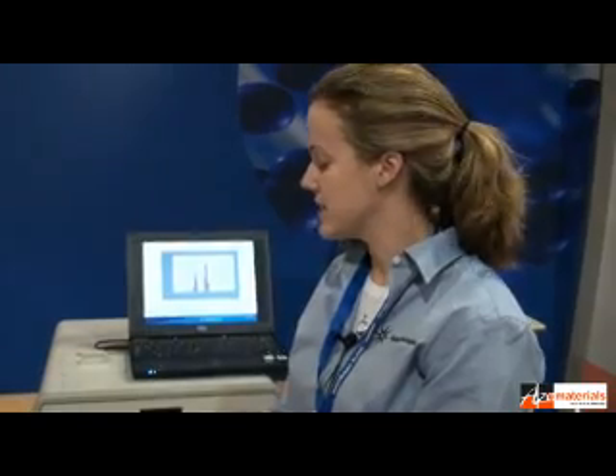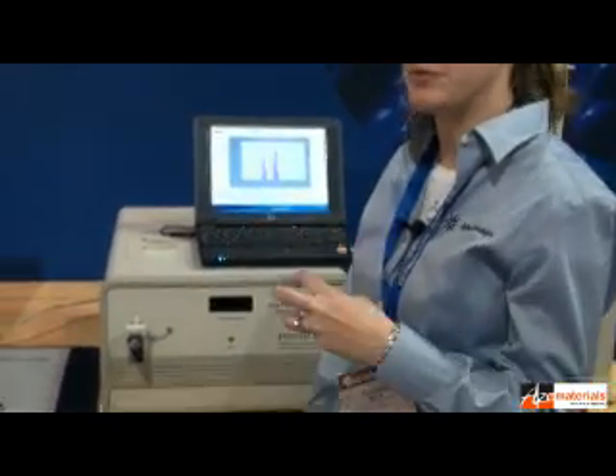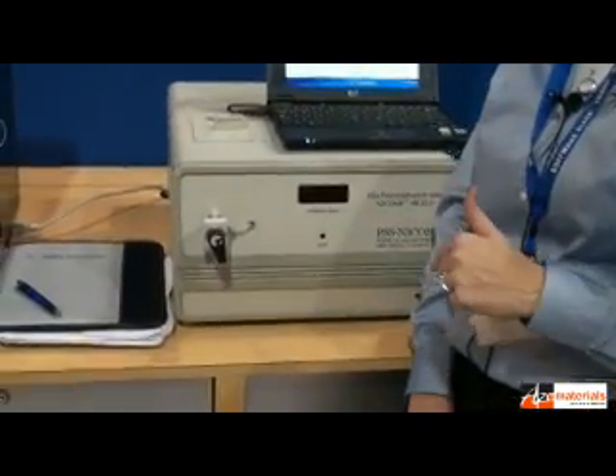This is Agilent's answer to nanomaterials for particle sizing. This can look from a few nanometers up to a few microns. It has the capability of doing both Zeta Potential and sizing.